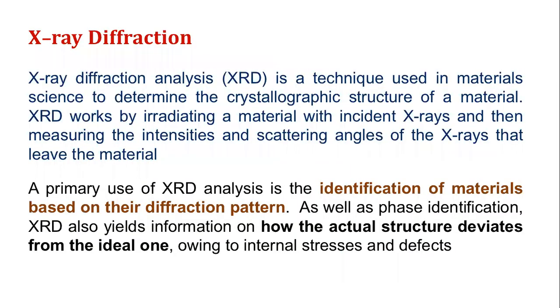So X-ray diffraction has been used as an analysis technique, which we call X-ray diffraction analysis, for understanding materials and determining the crystallographic nature of a material.